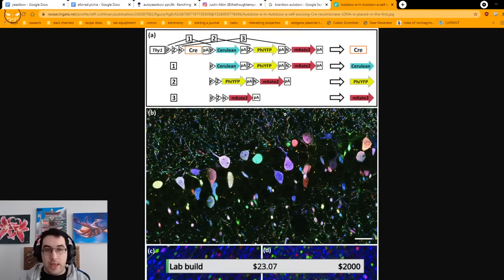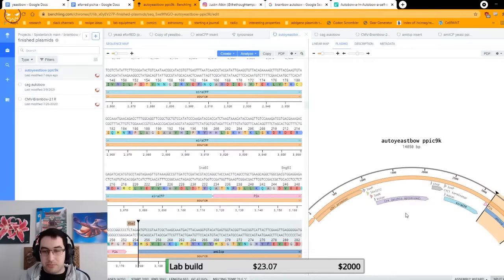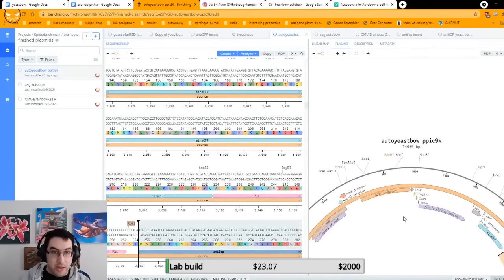So as a teaching tool, the amount of stuff that I just covered is insanity. It's all the multiple different markers, Cre recombination. But the other thing that would be really, really neat, because this is yeast DNA, this is yeast optimized, specifically Pichia, which is one of my favorite yeast to work with. Do you see how this says AOX1 promoter? This promoter is sensitive to methanol. So Pichia generally eat methanol, so of course they need something to tell them when methanol is present. This gene hijacks that system, and so this whole construct will only actually run when the yeast is given methanol.